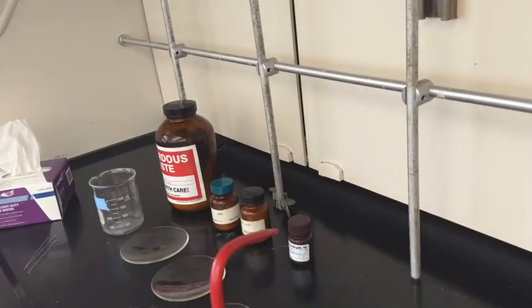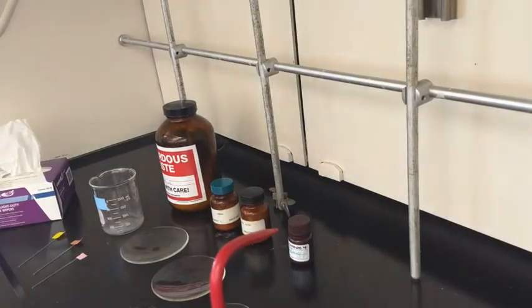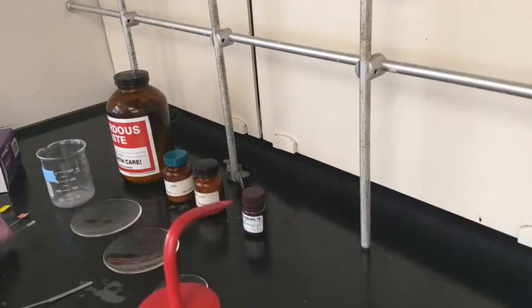We're going to use the melting point capillaries — they're closed on one end. You'll need to get those and then some label tape, because they're all going to look the same. Use different colors of label tape and lightly press it on. You'll want to record in your lab notebook what color goes with which sample.